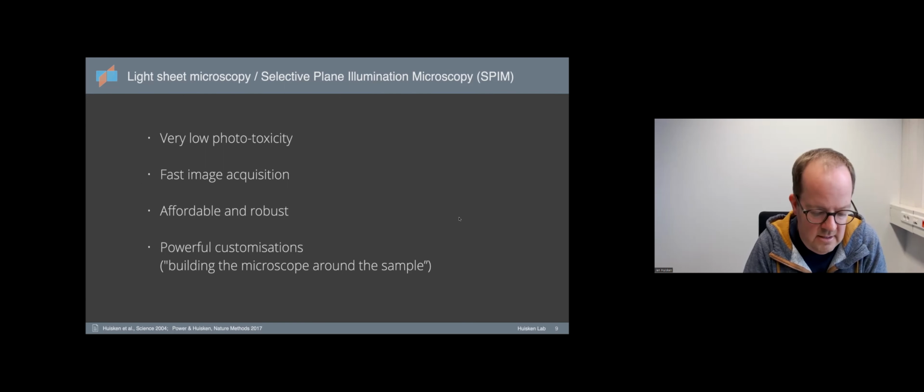And so there's plenty of fast cameras available to capture the fluorescence. The fact that we are so effective with how we excite the fluorescence means that you could even run the camera at thousands of frames per second if you wanted to, because you're not doing much harm by increasing the laser power, because you're only resting in one place in the specimen for a very, very short period of time.